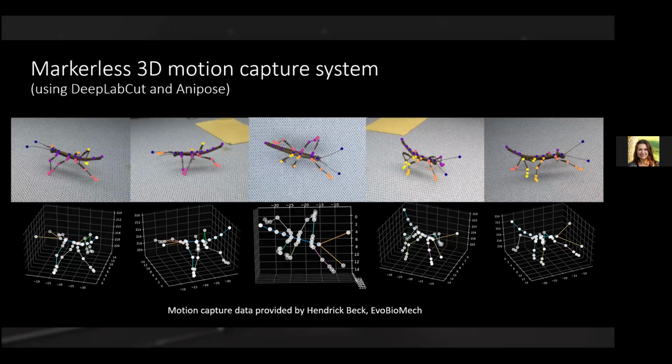So rather than having to obstruct your animal while it's walking around, you can define essentially landmarks on your model where you want the machine learning model to re-identify it. So here we have all of these wonderful 2D pose estimations after producing lots of training data that the system can now relatively robustly identify, at least as long as everything happens on that confined walking platform.